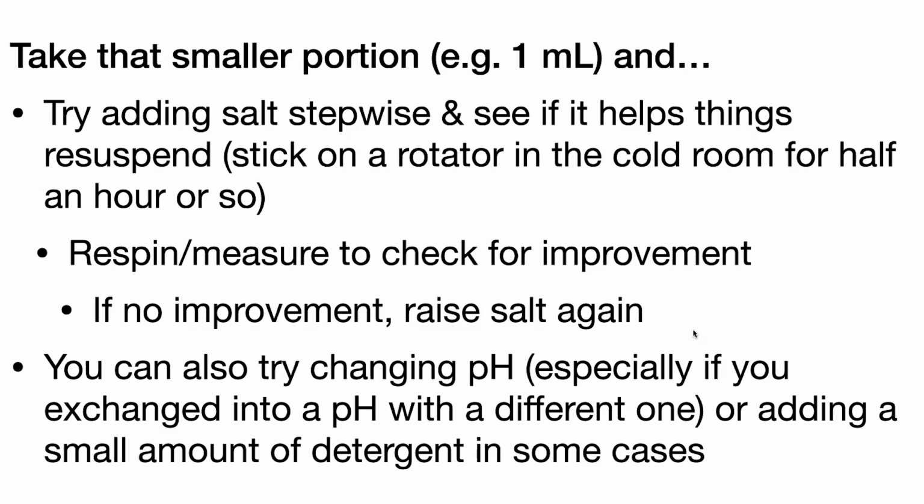So you see if this helps, and by then you can respin it and then measure the concentration again to check and see if it's any better. If not, then raise the salt again. If that's still not working, there are other things you can try.